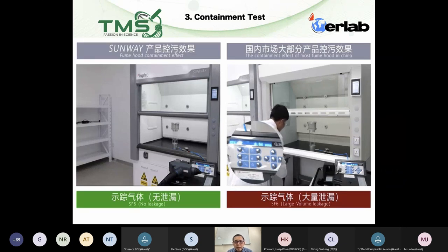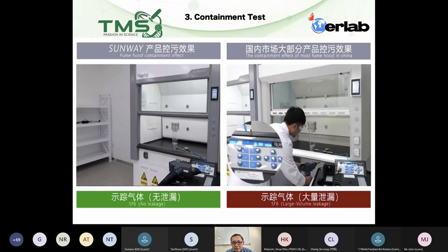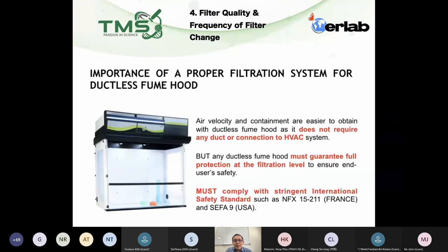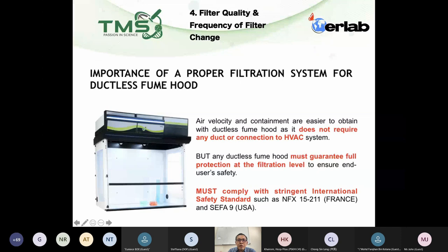Both ducted and ductless fume hoods should go through this containment test. International standards such as AFNOR XP X15-211 already require manufacturers to pass this containment test. If a fume hood has complied with these standards, you can confidently say it has passed the containment test.